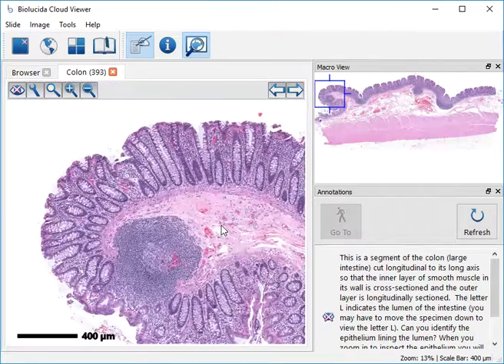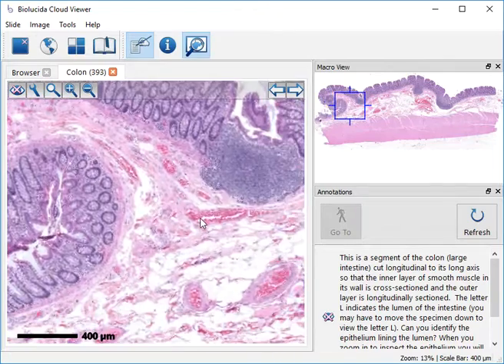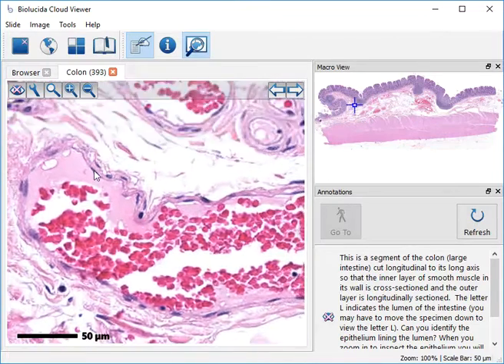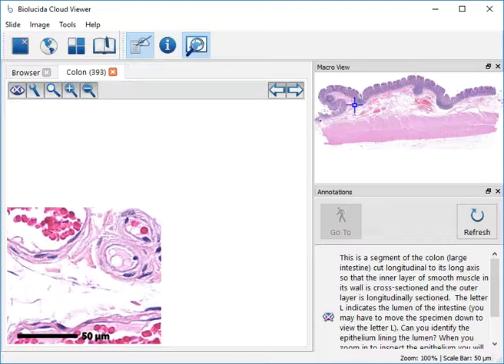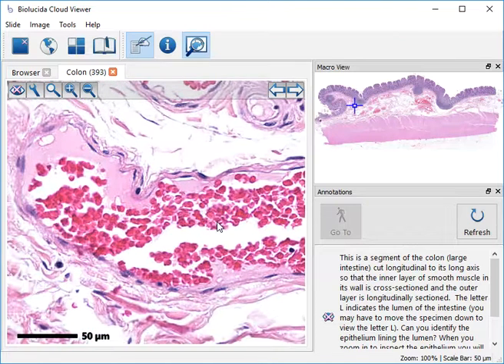And I think there are more blood vessels down here where we could see some examples of the simple squamous epithelial cells lining this blood vessel. And these are red blood cells. You can get an idea of their size by over here. You just kind of put this on here, 1, 2, 3, 4, 5, 6, 7, 8. If you divide 7 into 50, it goes about 7 times. So that would be about 7.5 microns in diameter.